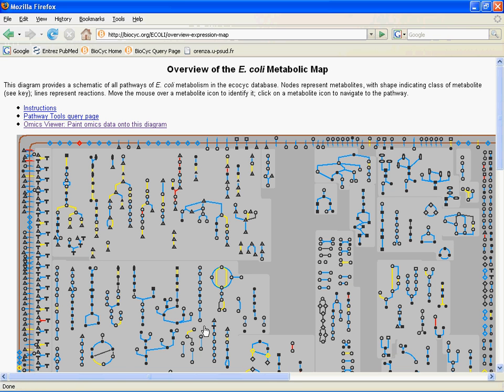Okay, so here we are. We're once again looking at a single column, single data point. We're looking at it on the Omics viewer, and we've set a 4-fold cutoff above and below, and basically now we have a 3-color display. I like this display a lot because it has that intuitive, I'm going to see exactly what I care about kind of look.